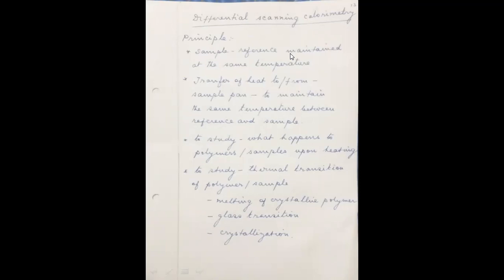Actually, it is not going to reveal the actual mechanism which is taking place inside the samples, but it will give you only the quantity of the additional heat energy to be supplied or the heat energy to be taken off from the sample to maintain the same temperature with the reference taken. So this knowledge gives you enough information to understand the mechanism of what is happening in the polymer and in the sample. Say, for example, melting of a crystalline polymer.